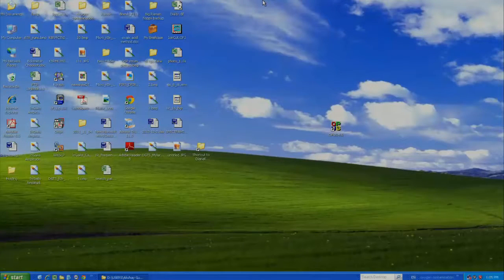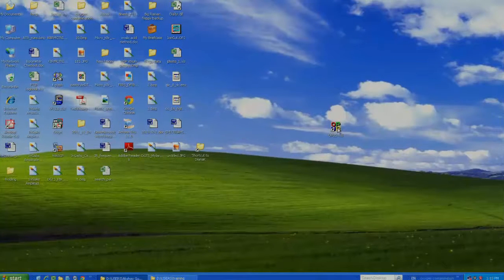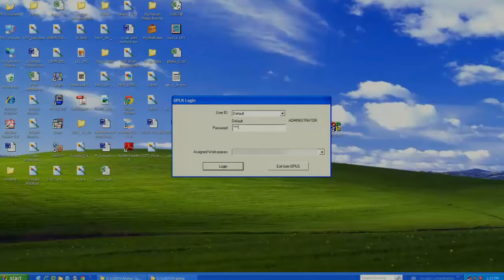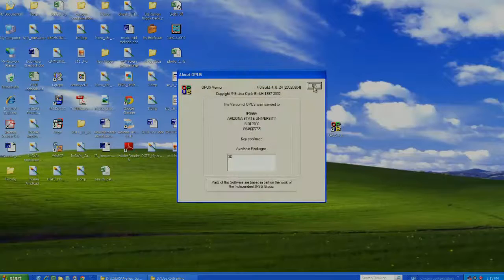Now you want to start the software. On the computer, double click on OPUS 4.0. The password is OPUS in capital letters. OPUS ENTER. Then click OK.